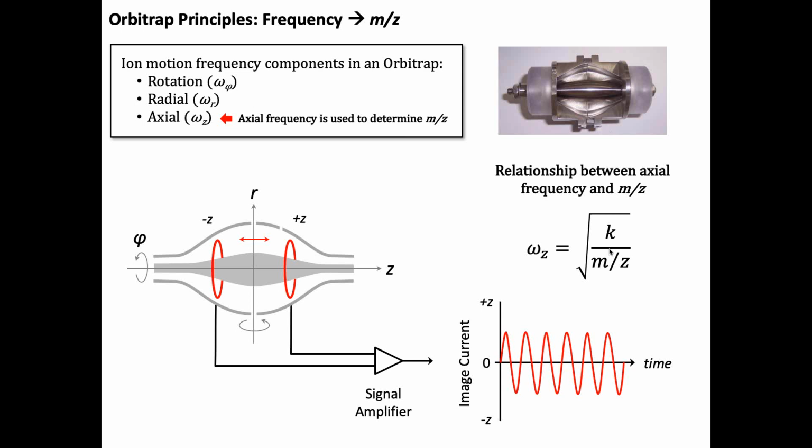If you've got a 10-second peak that's coming off of your LC system, and you've got 50 things coming off at any given time, you've got to do at least 50 MS events before that peak comes off, and there's all these other peaks coming and going at the same time. So a second is a lifetime on an LC time scale. But when you think about the complexity of the spectrum that you're seeing.